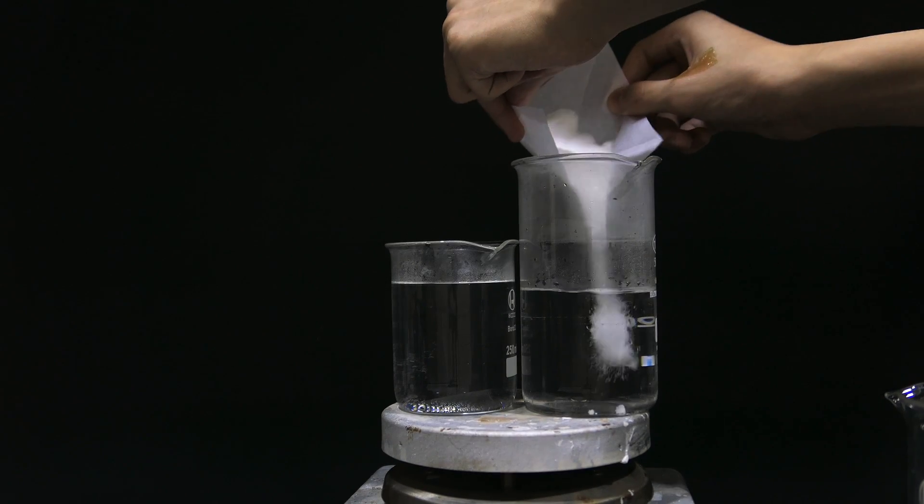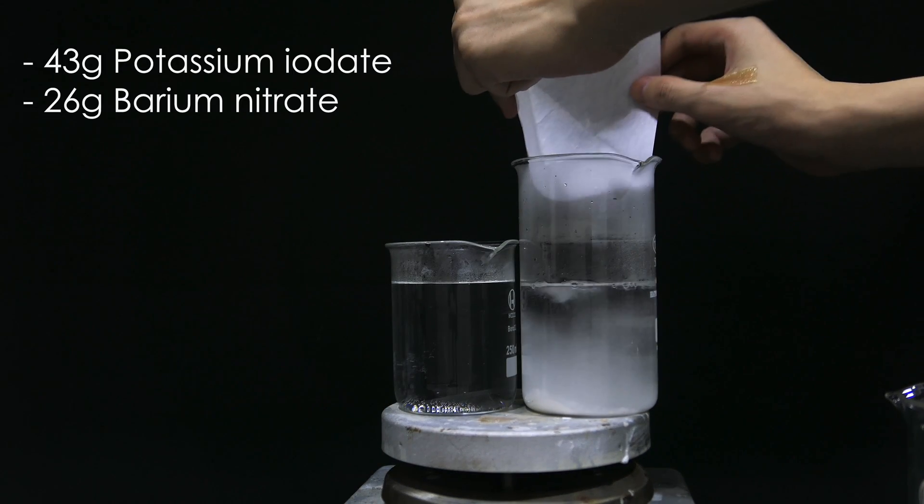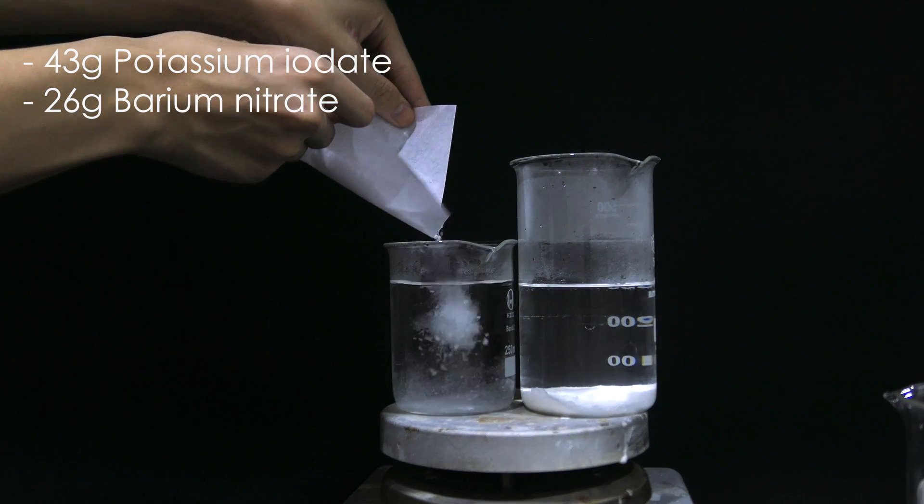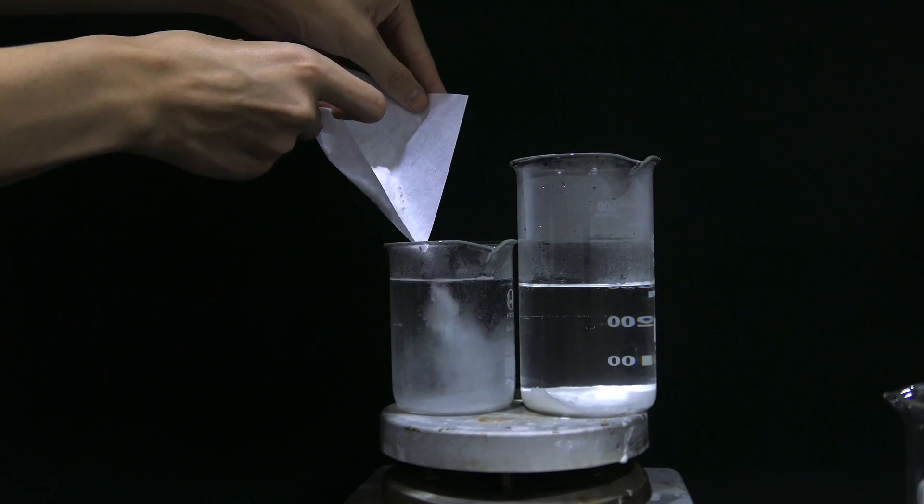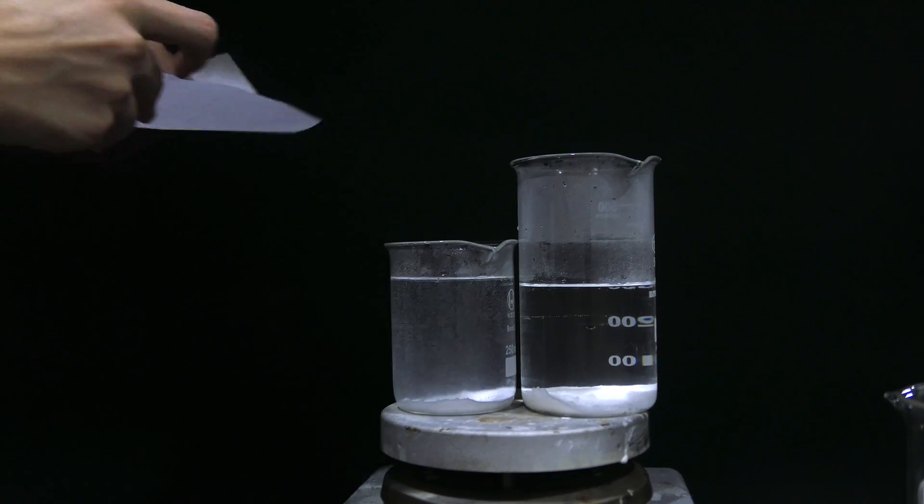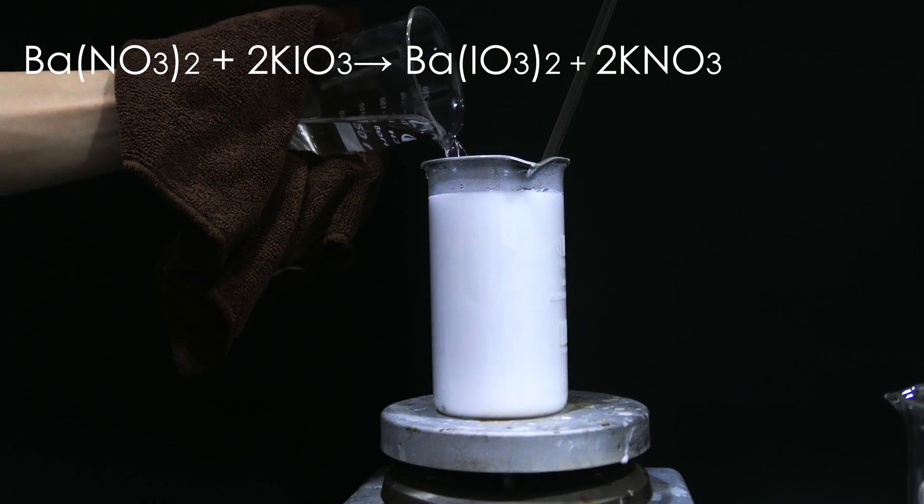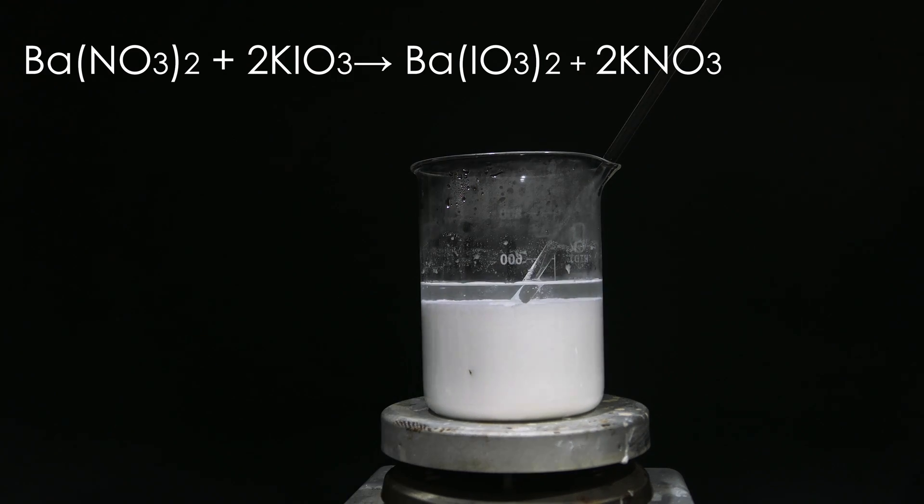And for the following step, I dissolve 43 grams of potassium iodate and 26 grams of barium nitrate separately, each in 250 mL of boiling water. Then add the two solutions together while boiling and allow it to cool. Then filter out the barium iodate.